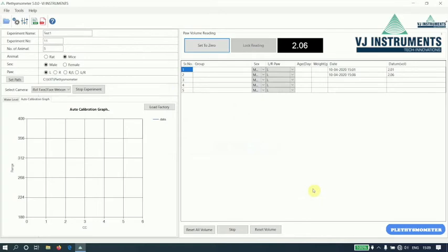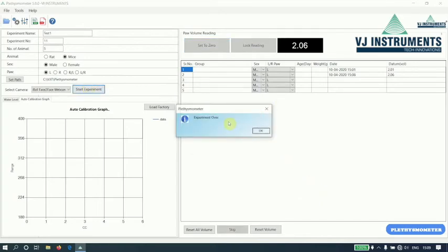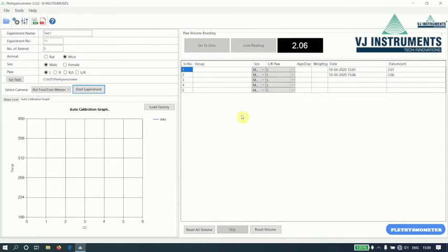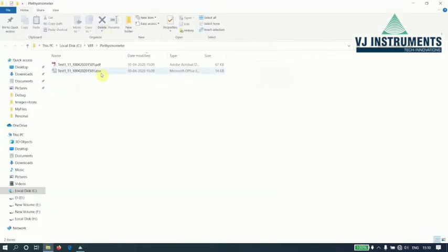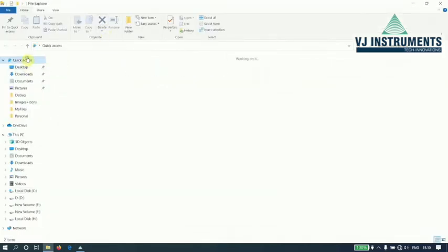Once the experiment is over, the experiment over message will be displayed. And the reports will be saved in this path. See, VJIT Plethysmometer or the path that we have set. Excel as well as PDF reports will be created.